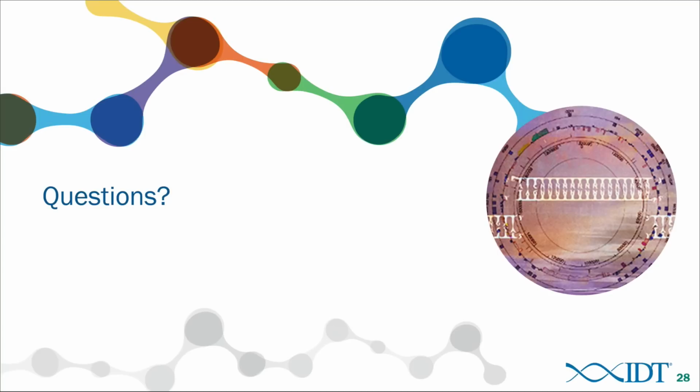This is a very specific one. I don't know if you'll have something for this, but we'll try. Can the Alt-R CRISPR system target highly repetitive sequences such as telomeric DNA or other G-rich repetitive sequences? Well, the answer would be yes, but targeting a repetitive element would have the inherent risk of off-target effect. We haven't specifically tested that, would be the short answer.